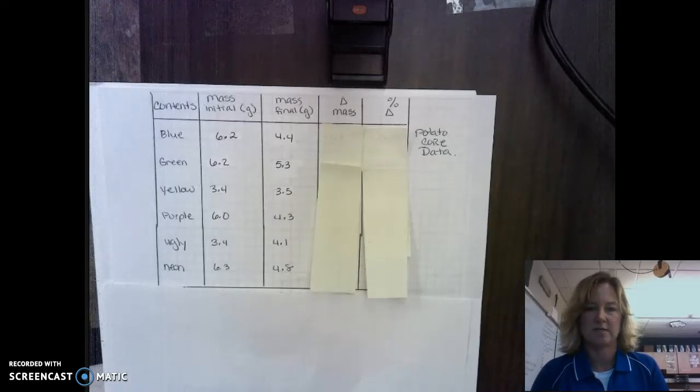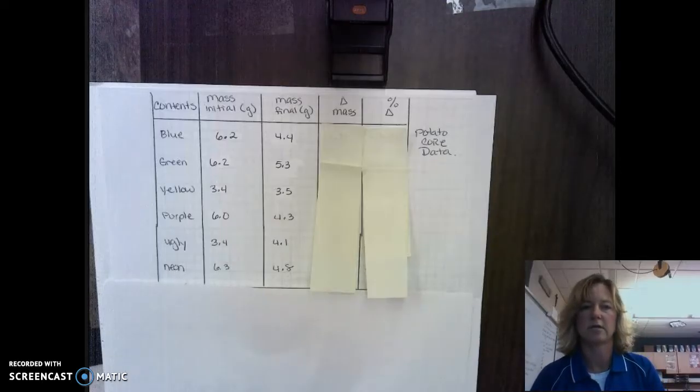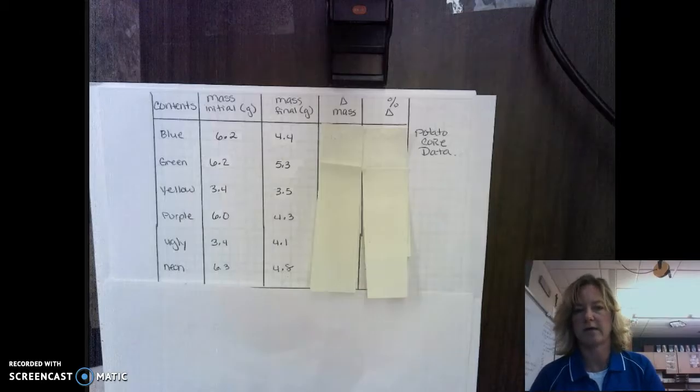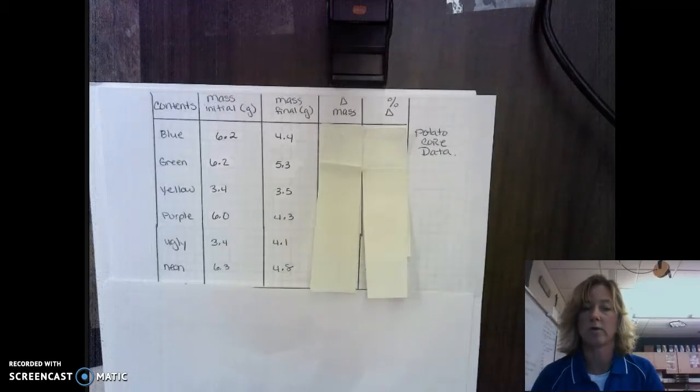Alright, so we just finished setting up and recording the data for potatoes, different potatoes that are placed into various solutions with different molarities. I accidentally mislabeled the containers, so we color-coded them with different food coloring dyes so that we could tell the solutions apart. Now our job is to use our data to figure out which solution is the 0 molar solution, or distilled water, which one is 0.2, 0.4, 0.6, 0.8, or 1.0 molar solution of sucrose.